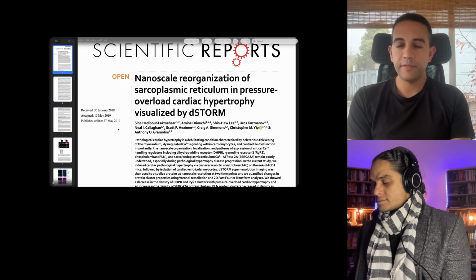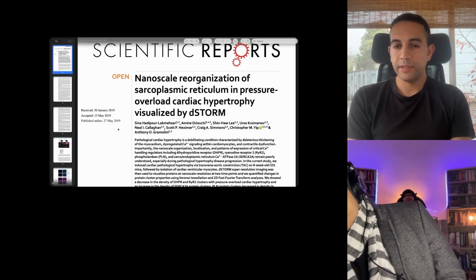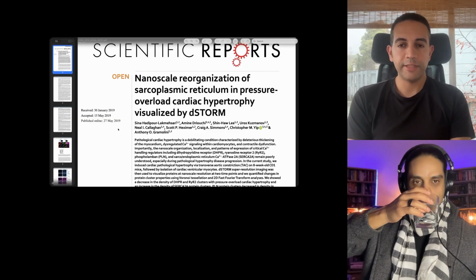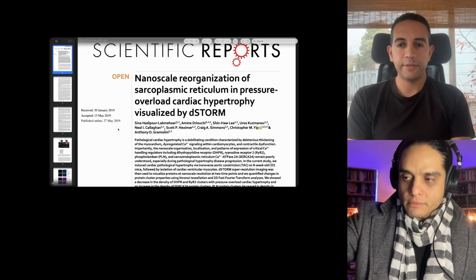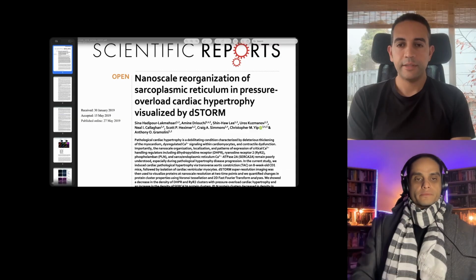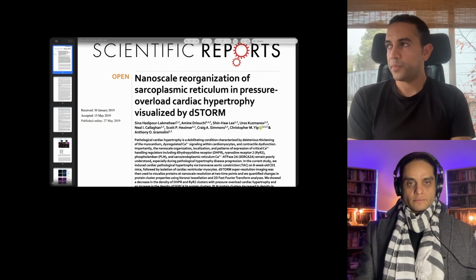There are microscopy groups on the bleeding edge, like Eric Betzig's group, doing all sorts of volumetric imaging, who barely have to compromise photons to get really good Z resolution. So it's not insurmountable, but it requires party tricks that are non-trivial.